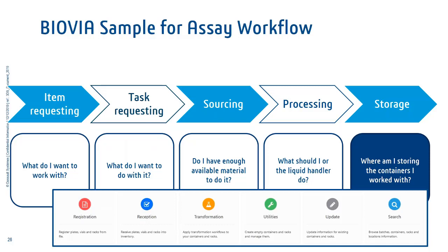Reception, when you're receiving plates, vials, and so on. Transformations, so starting from existing items to create new ones, etc.